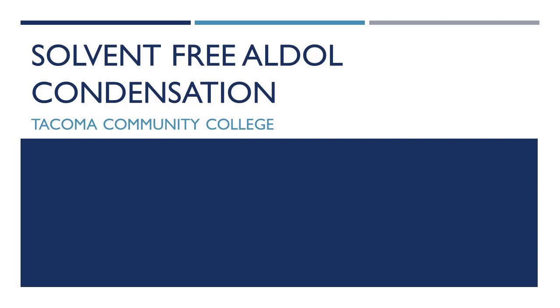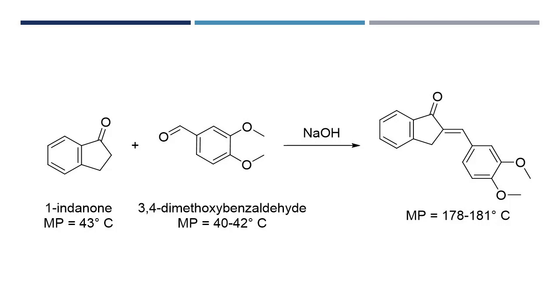Welcome to the solvent-free Aldol condensation lab at Tacoma Community College. In this lab, we will combine 1-indanone with 3,4-dimethoxybenzaldehyde and sodium hydroxide to create an aldol condensation product.